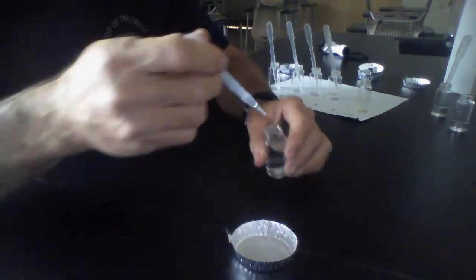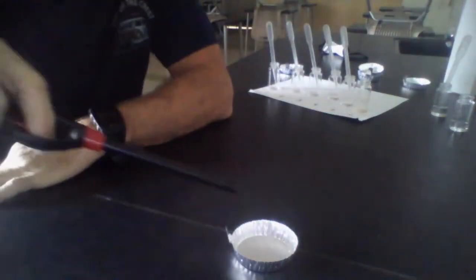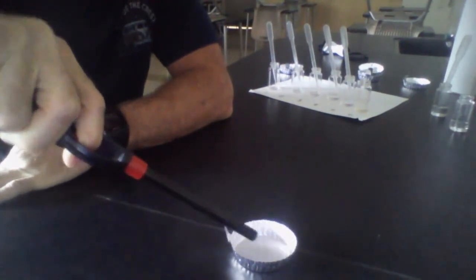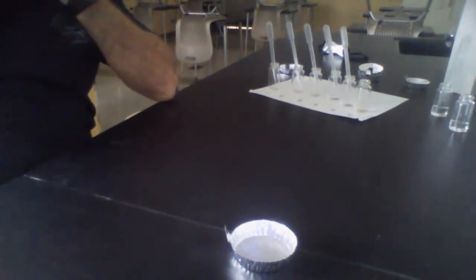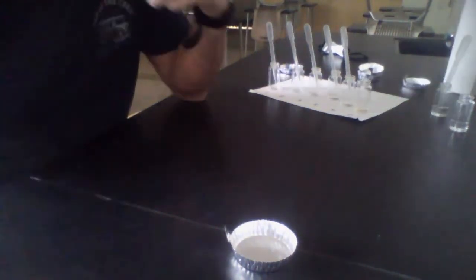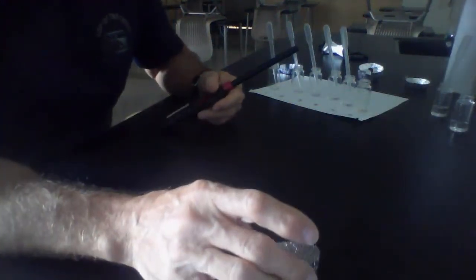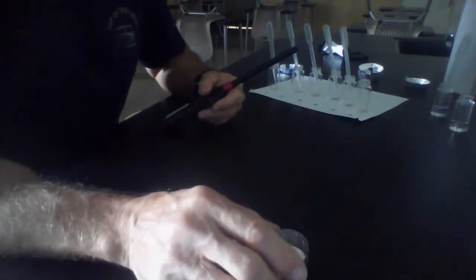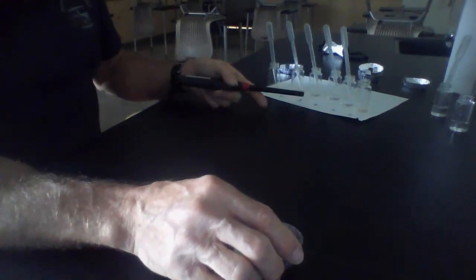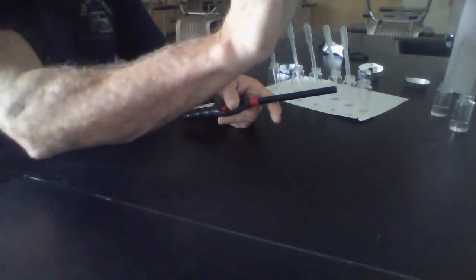Can you stick around, Bink, and tell me how you would describe how it burns? 3, 2, 1, go. Blue flame. Don't blow on it. It's lasting quite a while. Gone. And it leaves behind a little residue. She does see residue. I agree that it, I don't know about lasting. If you had seen the other ones, you might have thought that it actually was a little bit quicker than the other ones. And it does leave these obvious droplets that look like water, don't they? Yep. Okay. Thank you, Bink.